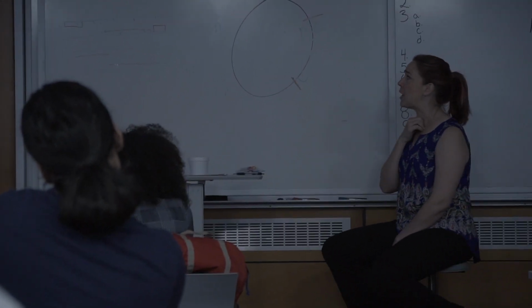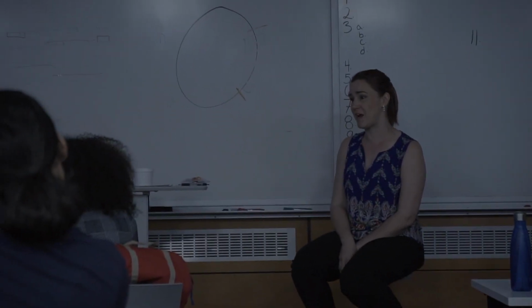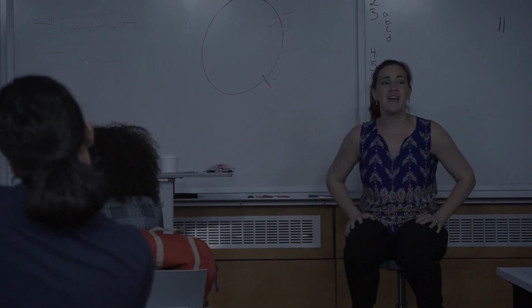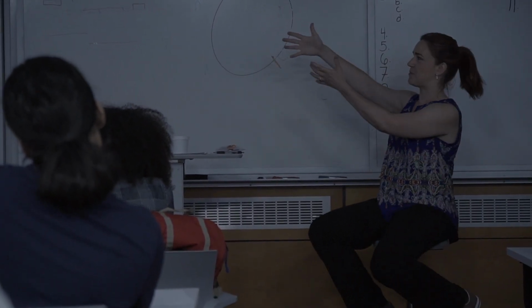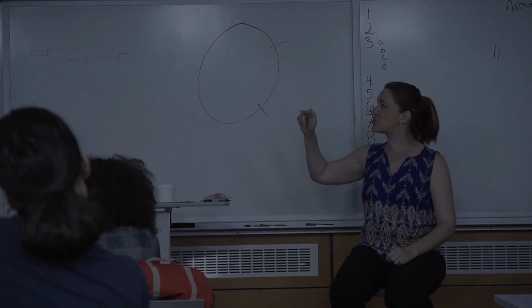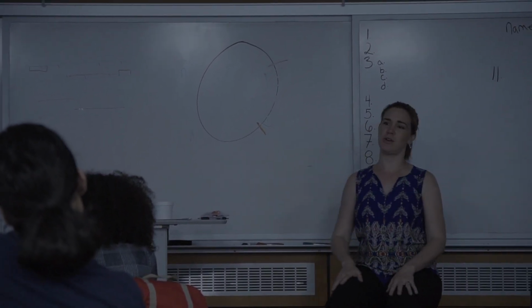And I think an important point in that is to become a good researcher and a good scientist. I did say it's like cooking, but you're not blindly following recipes, right? You want to become a chef. So you want to be able to bring in ingredients and taste it and figure out if there's too much salt. And so the better you get, you don't just look at this data and show your mentor. I mean, initially you're just like, yeah, this is what happened, I don't know. But you want to always be thinking, wow, that's not what I expected. Why do I have 2 bands and what might have gone wrong? And each time you learn tricks and what you should look for next, and you get better and better at troubleshooting. And then eventually you discover something and you change the world, maybe.